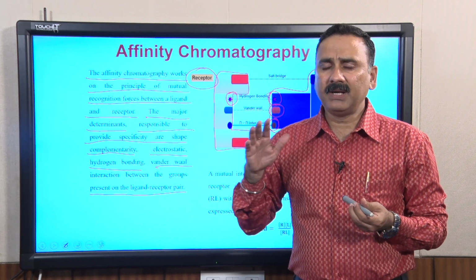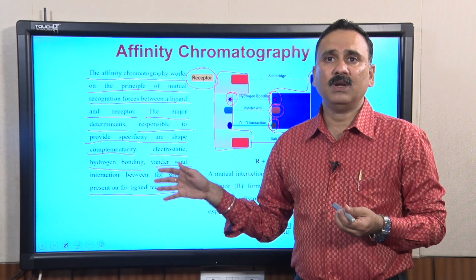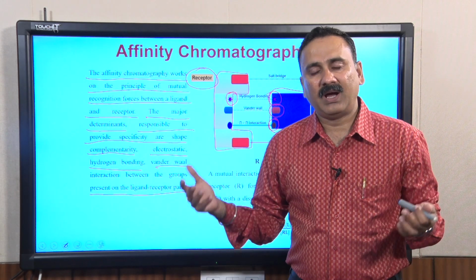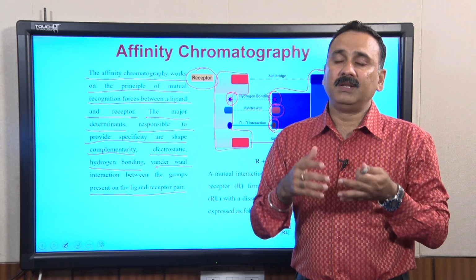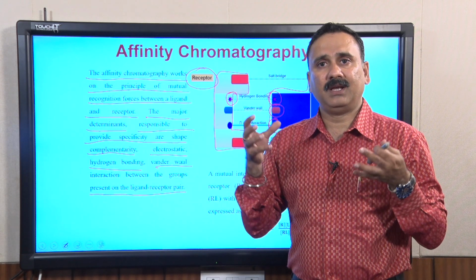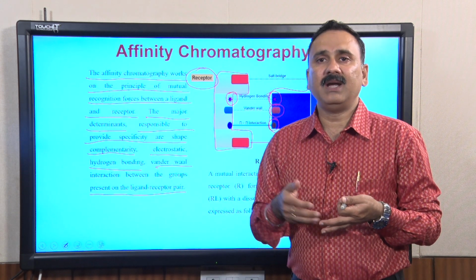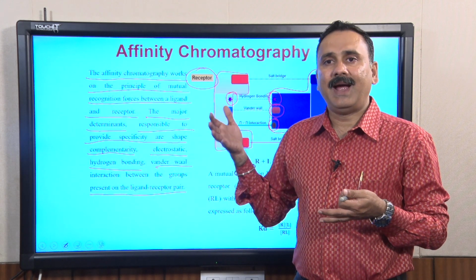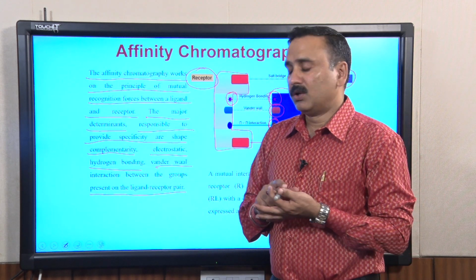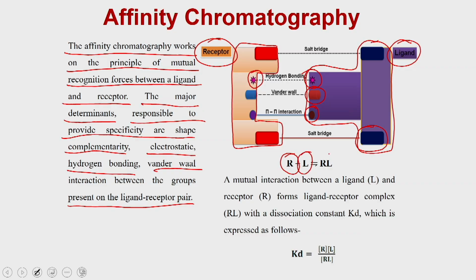That is why a particular receptor is going to interact with a particular ligand, or a set of ligands, which have these characteristics: they have a complementary shape, and these complementary shapes also share many of these groups in their specific locations, so that when they come together, these groups participate in hydrogen bonding, van der Waals interactions, very strong pi-pi interactions, as well as salt-bridge interactions.